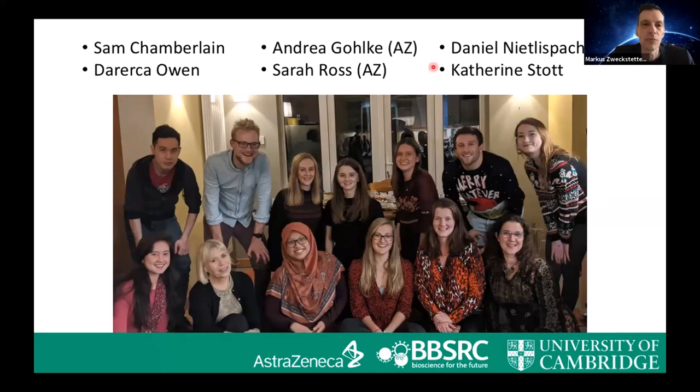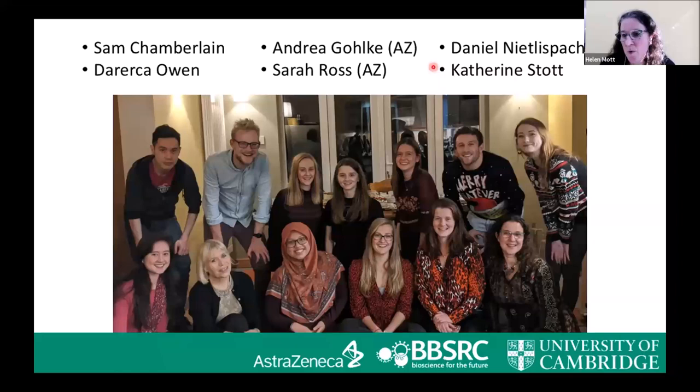Yes, it is calcium dependent. And yes, we're pretty sure it's 1-to-1 from the titrations as well as everything else. And the ITC is obviously the experiment you would do to work that out, but this was always with the nanodisc bound protein, and there it's really difficult to work out the actual concentration of RAL-A that you've got there, but we think it is 1-to-1.